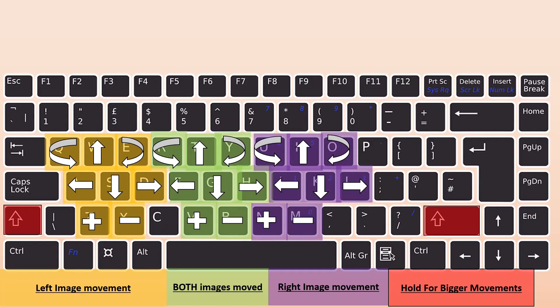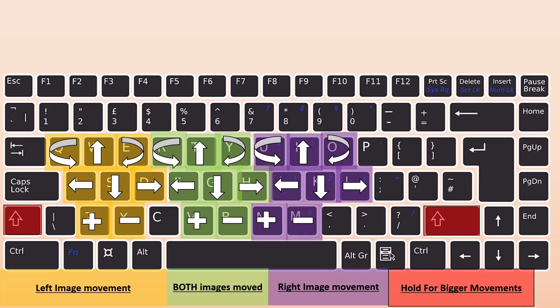And then you can also zoom in on the images using these keys. Z and X for the left image, N and M for the right image, and V and B for both of them together. Again, if you hold down shift for any of these movements, either rotations or zooms or up down left right, you will get a bigger change.